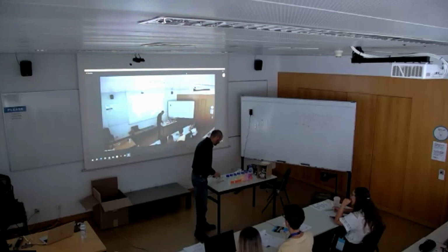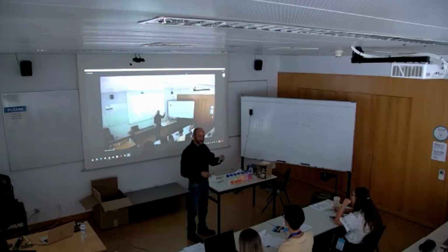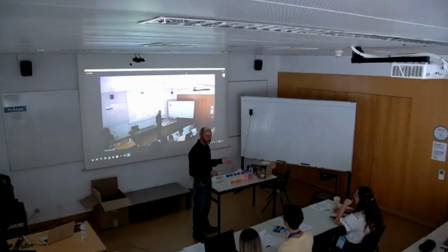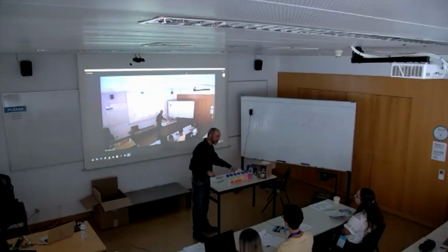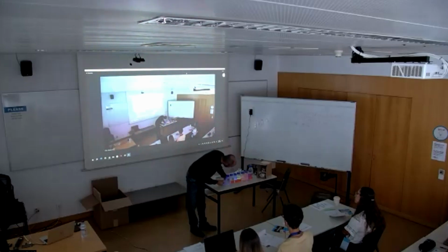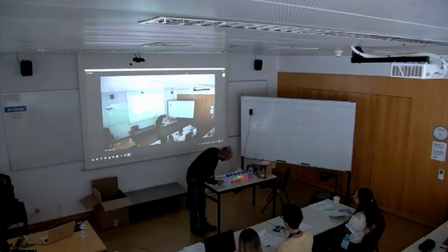But what will happen if I now use a 450 nanometers laser? This is visible, it's blue, it's 450. What do you expect? I think it will also do this because this one has 456 as a requirement. This is 450, so it should be fine. Let's have a look. Ta-da! So this one doesn't. Do you remember the difference? You see a little bit of light there, and you might say, "Oh, I see something." But that is just the laser, which is not invisible. That one is instead the fluorescent effect, the emitted light.